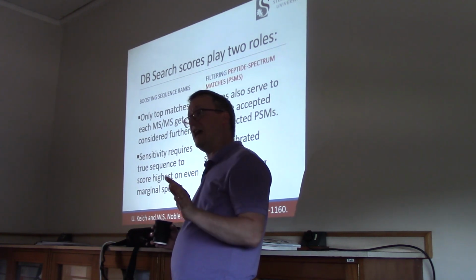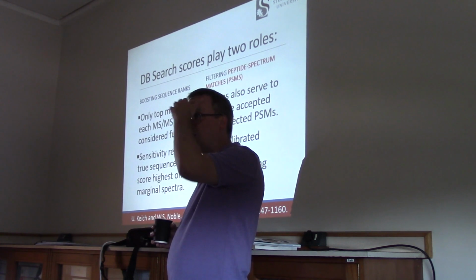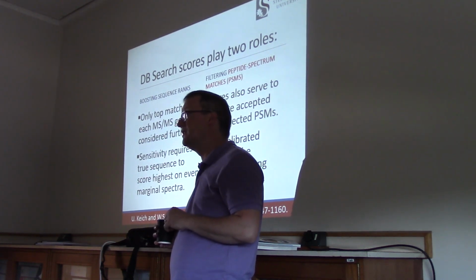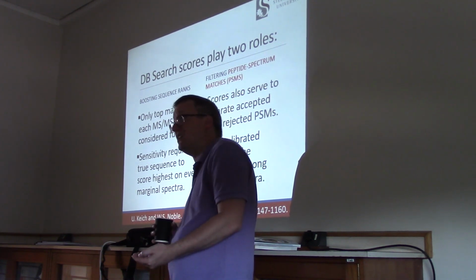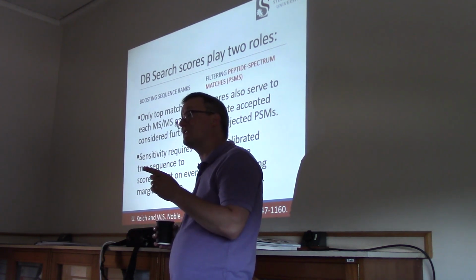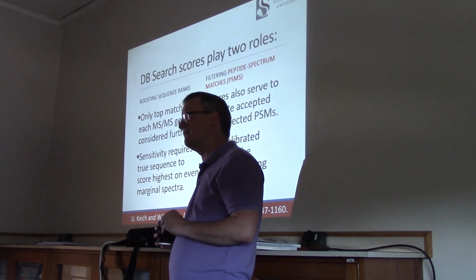In a case like that, the search engine is going to do the best job it can for explaining why that spectrum looks the way it does. It's going to put some peptide sequence up against it. But its score should indicate that we don't have the right sequence associated with it. So that's a really important lesson for proteomics. If it's not in the database, your search engine isn't going to identify it.